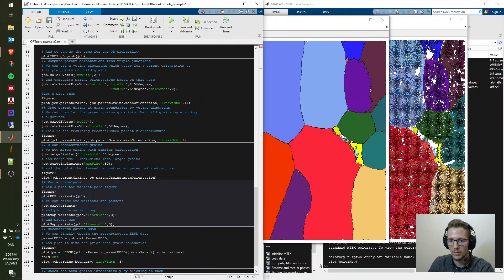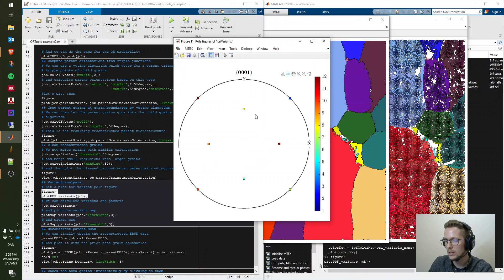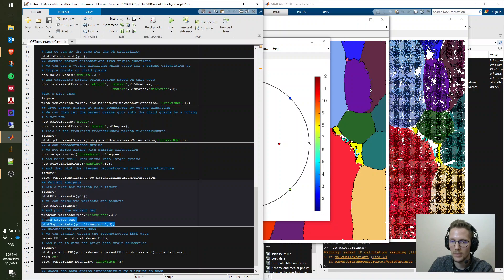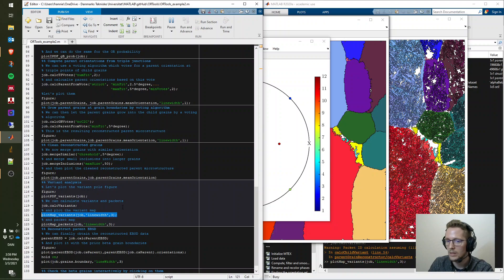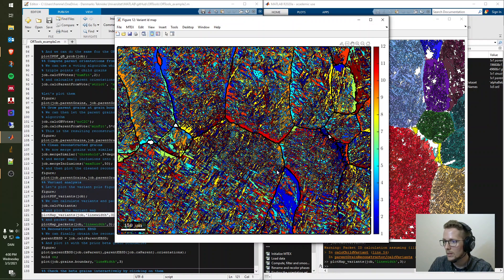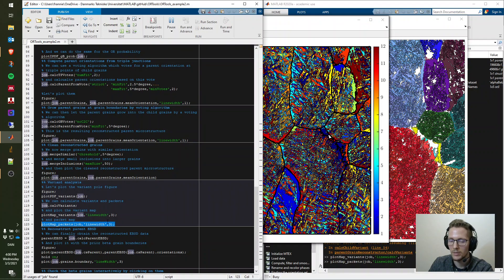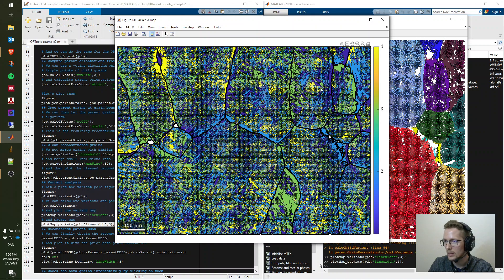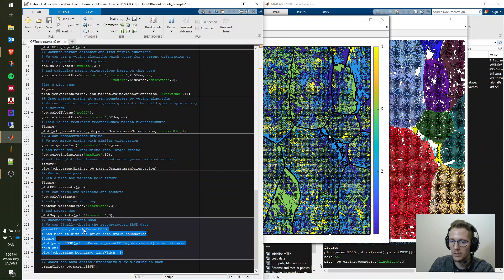Next we do variant analysis. We first plot the theoretical variants — about six are visible here, but there are actually 12, with some overlapping or exactly opposite each other. We calculate the variants and plot a map coloring all alpha grains by their variant identity. On top of that we can also plot the packets, generating a packet identity map.